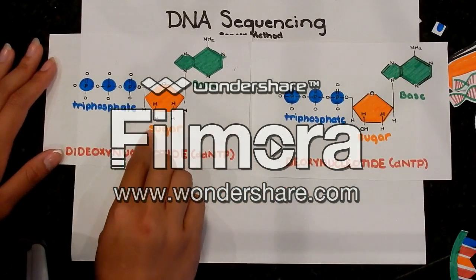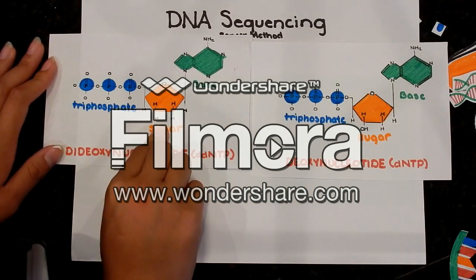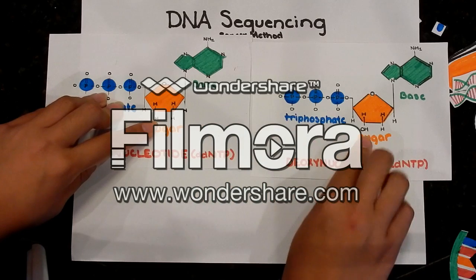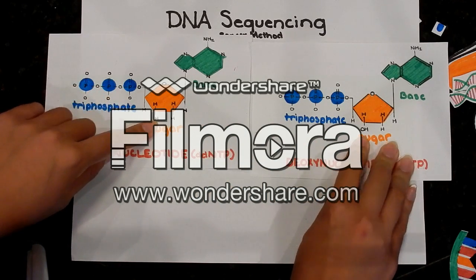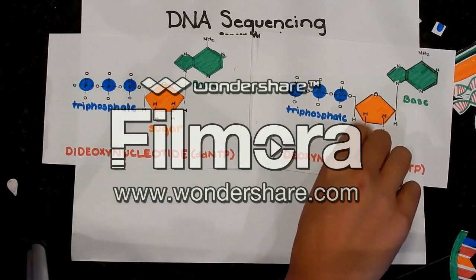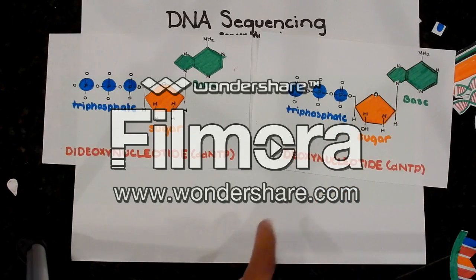Dideoxynucleotides have a hydrogen atom at the 3 prime position, while deoxynucleotides have the hydroxyl group. Now this difference of hydrogen and hydroxyl is very important because it determines whether or not the DNA chain terminates.